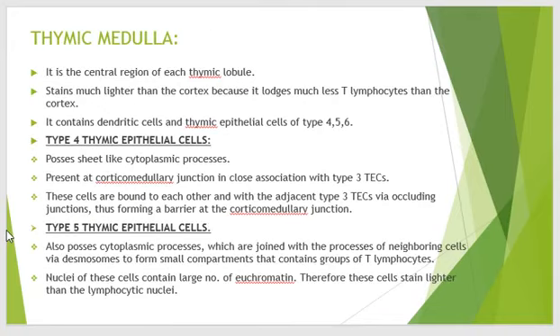The thymic medulla is the central region of each thymic lobule. It stains much lighter than the cortex because it contains far fewer T lymphocytes compared to the cortex. The medulla contains dendritic cells and thymic epithelial cells of types 4, 5, and 6.